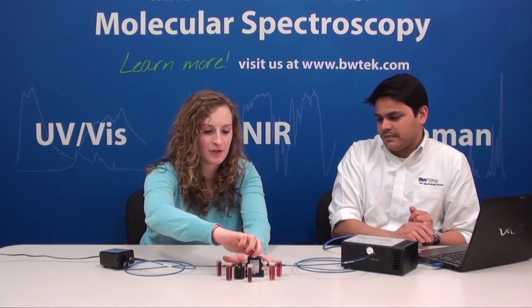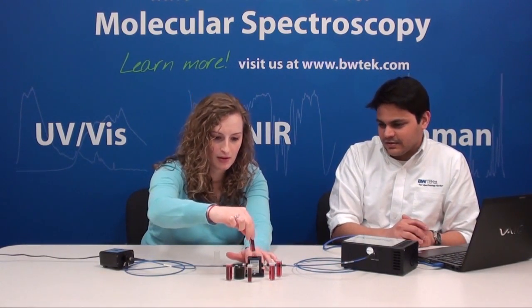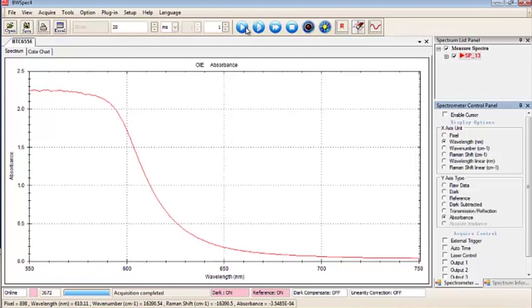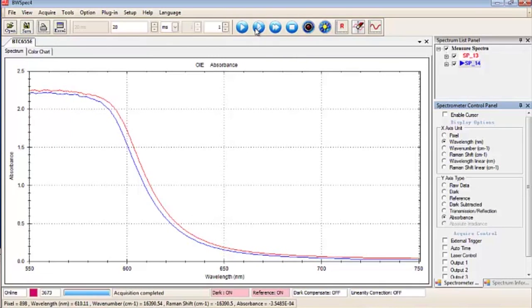Can I go ahead and take the first measurement here? Sure, why don't you start with the highest concentration. What I'm going to be doing is just taking single acquisitions of each of these five samples in order to measure the absorbance curve. And since I have the spectrometer on overlay mode, it's showing you all the different intensities as well.